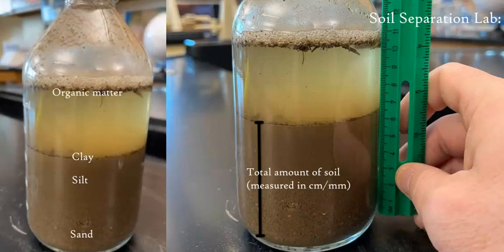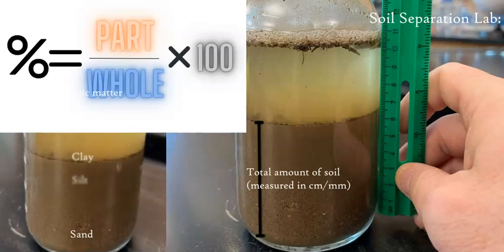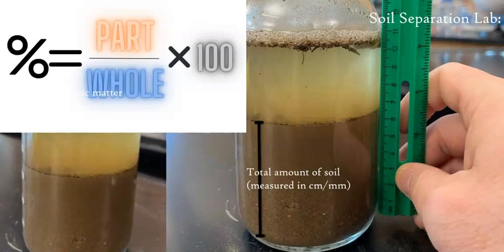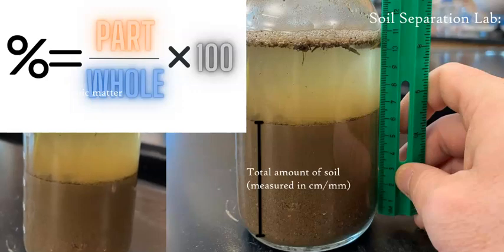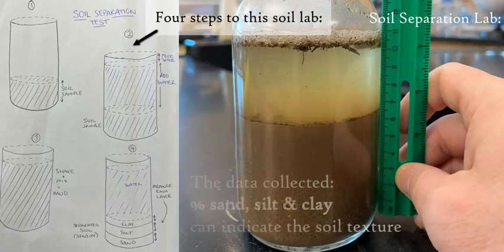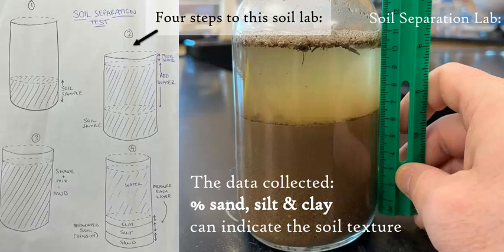And then you can measure the overall amount of soil you have with a ruler using centimeters or millimeters, and then you can use your simple math to figure out the percentages of both the sand, silt, and clay compared to the total amount of soil you have in the bottle. So once you have your measured amount of sand, silt, and clay, you'd put it into the formula and divide it by the total amount, and you get a percentage of how much sand there is within this soil amount, and silt, and then finally clay.